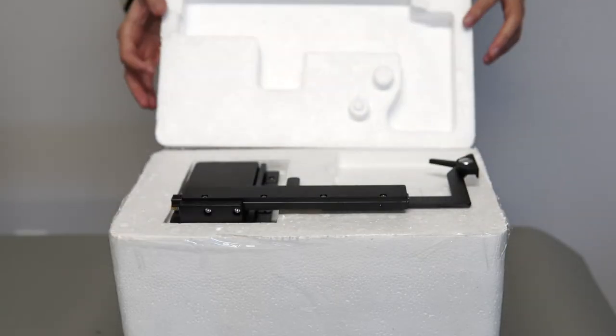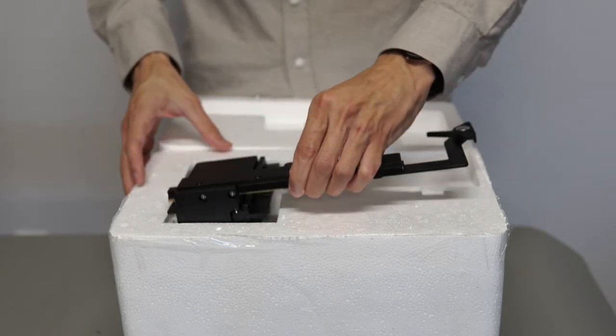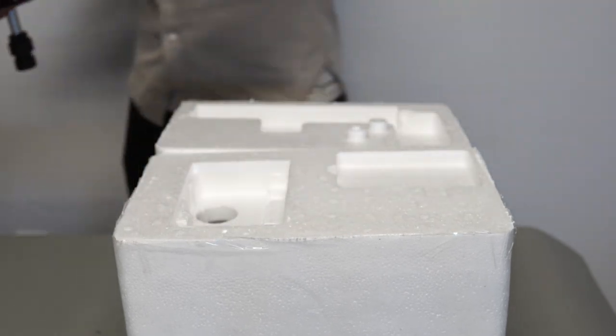If you ordered any additional accessories such as an XY mechanical stage or additional stage inserts, you should have a second box. They will be inside there.